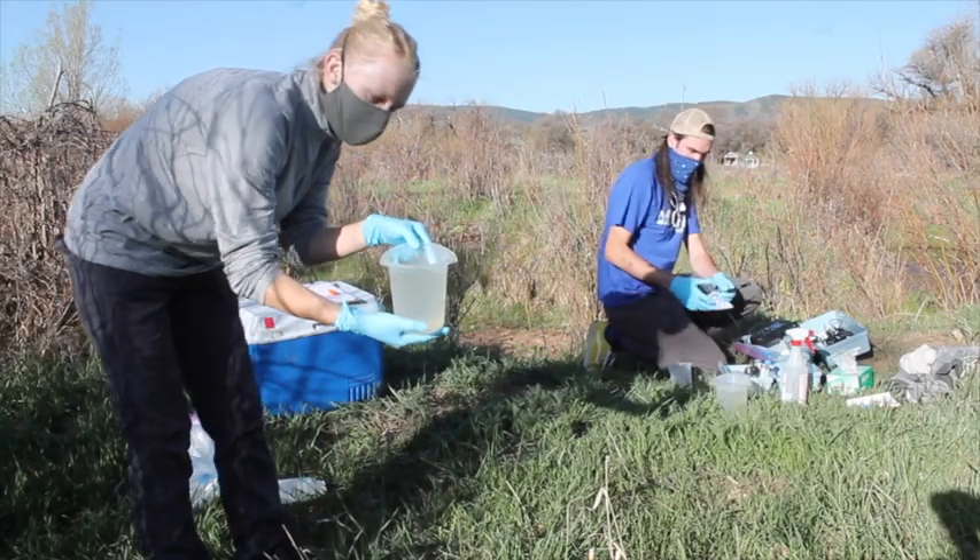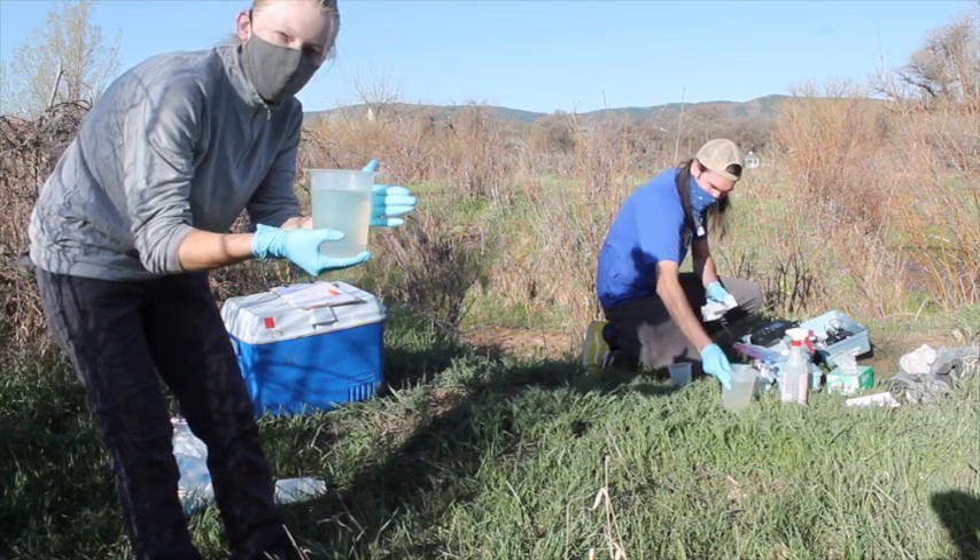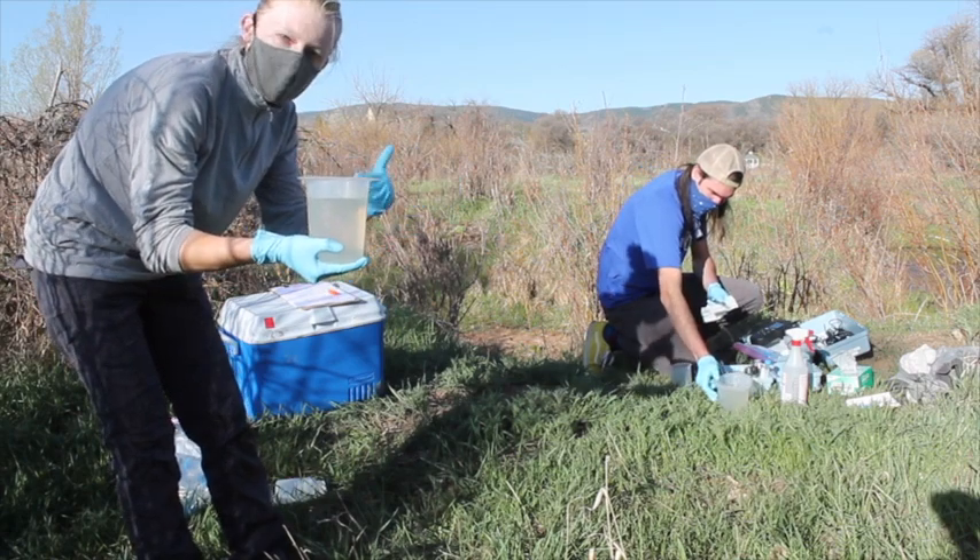So we've got our water samples — beakers we just collected from the creek. We've got one for Sam and one for me for our sample prep.